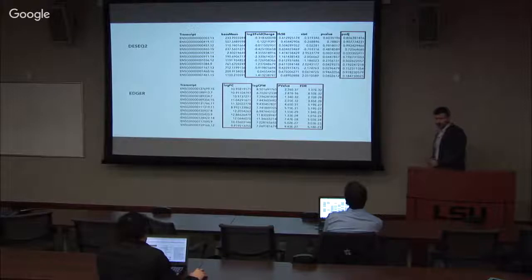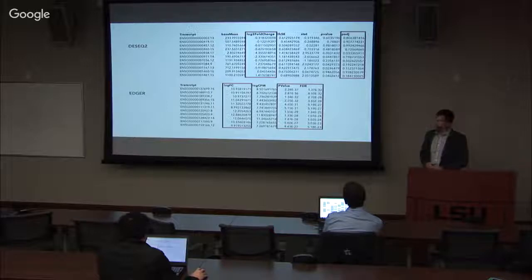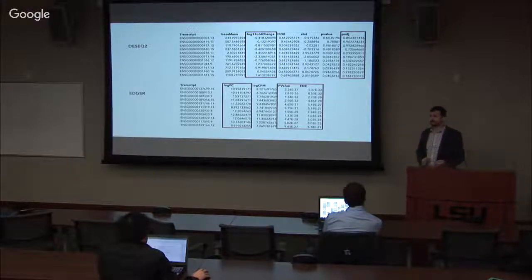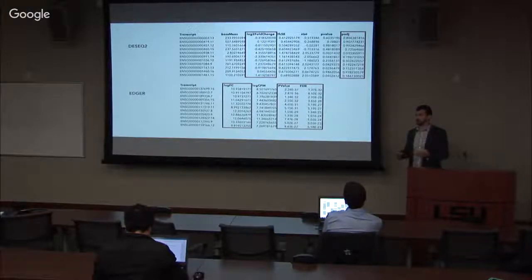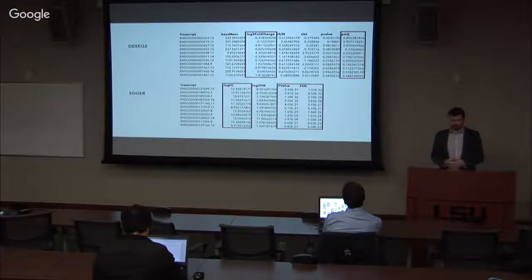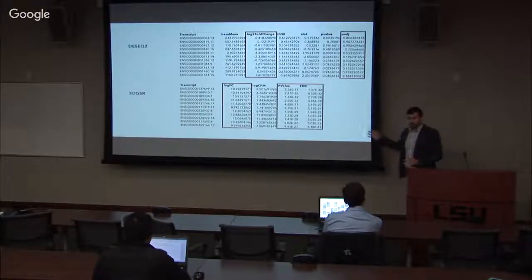Now, finally, we talked about DESeq2 and edgeR. And there, the main two considerations are the significance of a gene that has been identified as differentially expressed, and your log fold change, or fold change: not just whether there is a significant change, but also quantifying the difference.